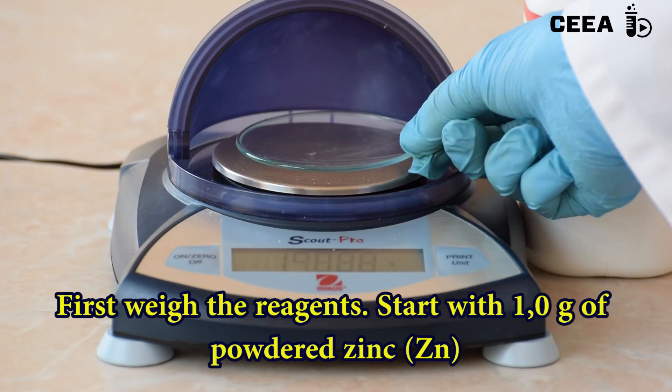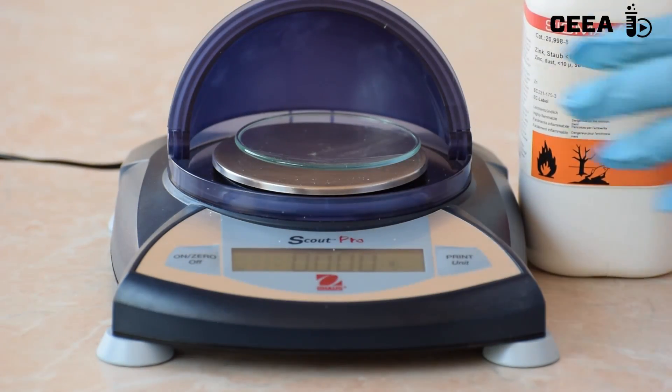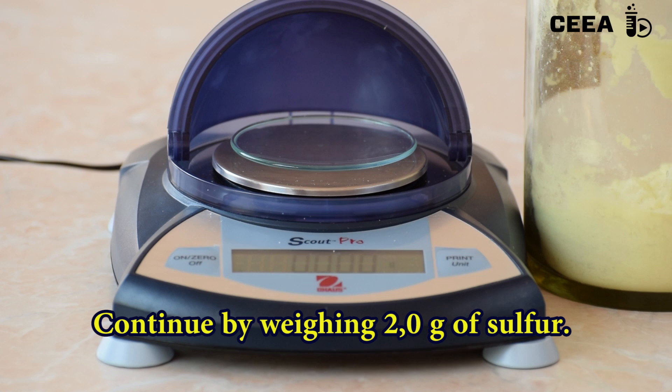Start the experiment by weighing the necessary reagents. You will need one gram of powdered zinc. The second reagent, the sulfur, is needed in a double quantity: 2 grams.